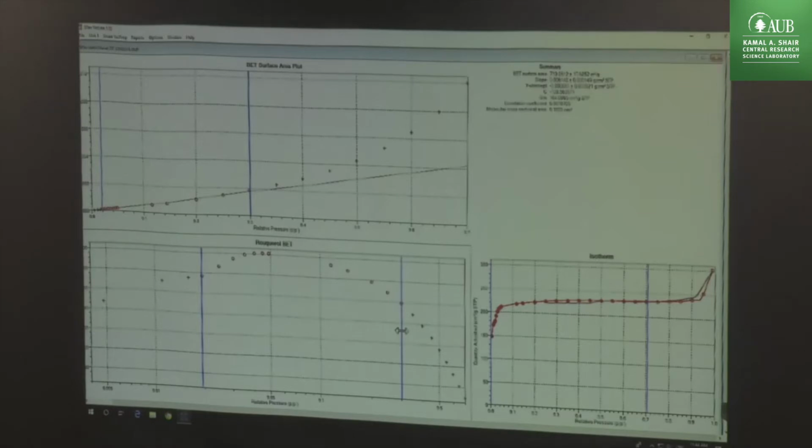So you don't rely on the instrument. The instrument gives you any number, it does not know what the limits are. Now we are working on smart software. The smart software may become available next year, and you will have it for free.